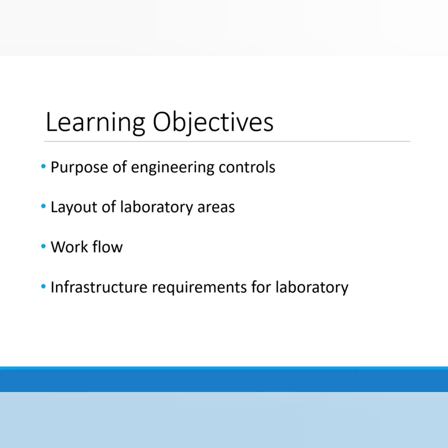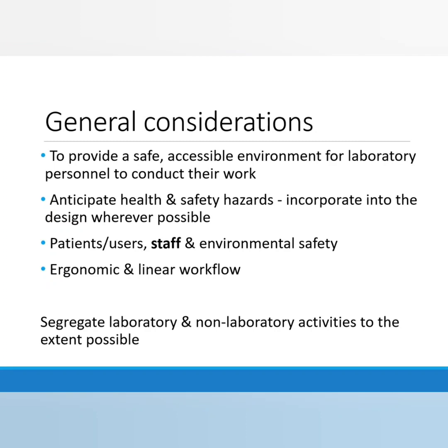Engineering controls, layout of laboratory areas, workflow in a laboratory, and the infrastructure requirements for a laboratory. General considerations to be kept in mind while designing a laboratory.